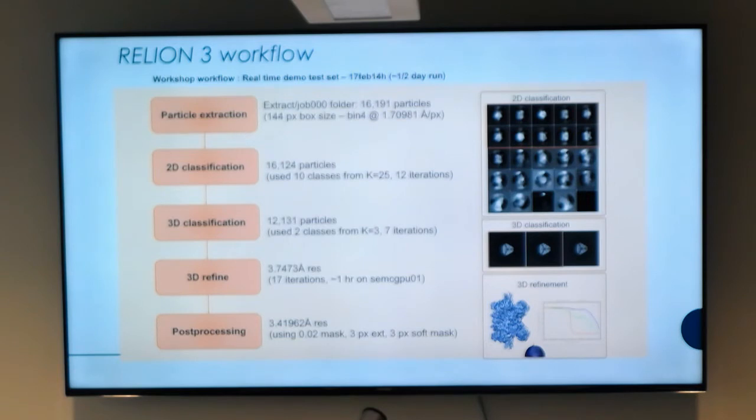But again, these are now additional and more informative questions you can ask on your data set that you may not answer if you're just looking in 2D. So it behooves you to parse your data, to be very efficient in analyzing your data. It doesn't take too much time, and it will help you be in a better position for answering your scientific questions.